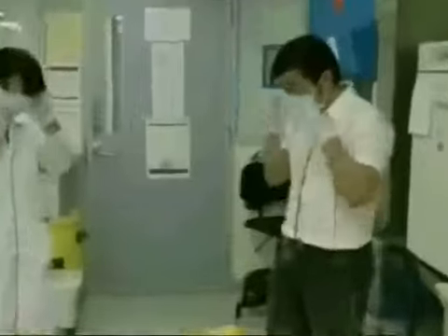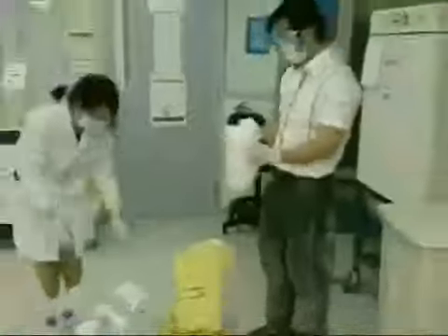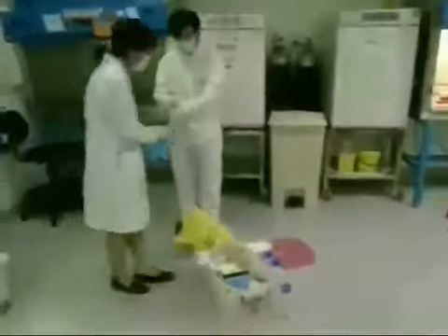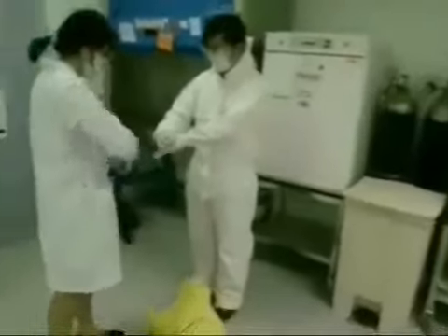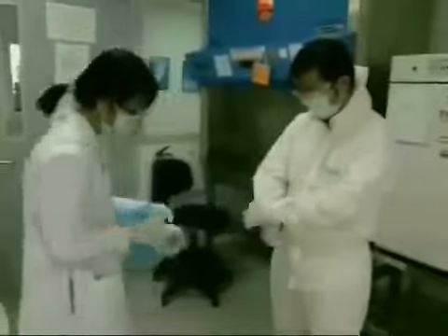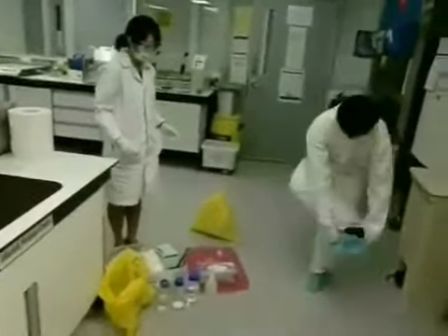Michael, it is important that you wear double gloves to clear the spill. Michael, remember to wear double gloves, okay? You forgot to wear double gloves.